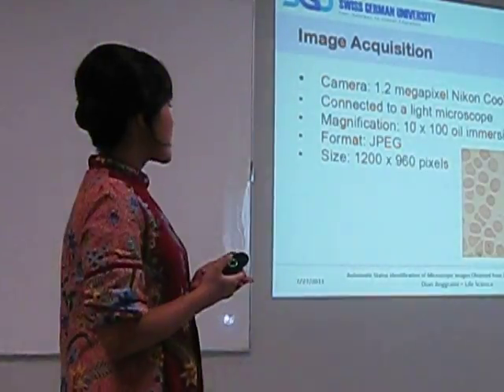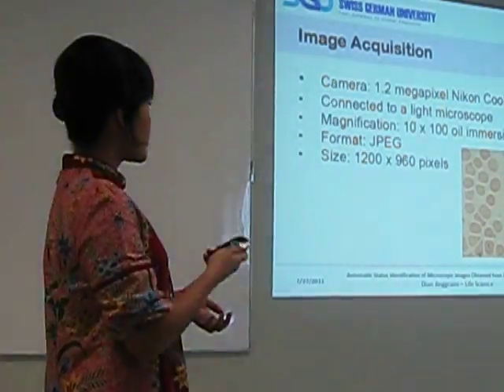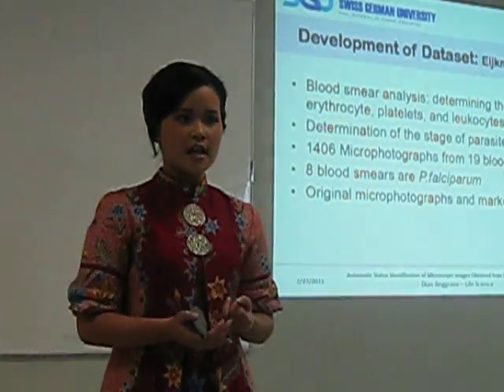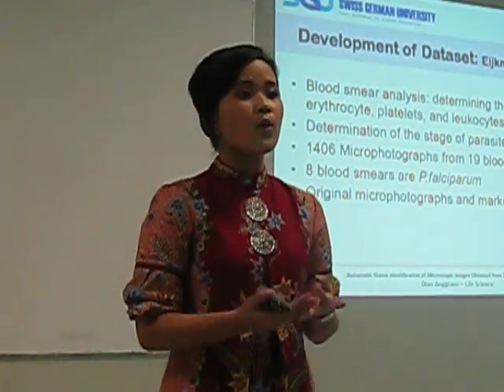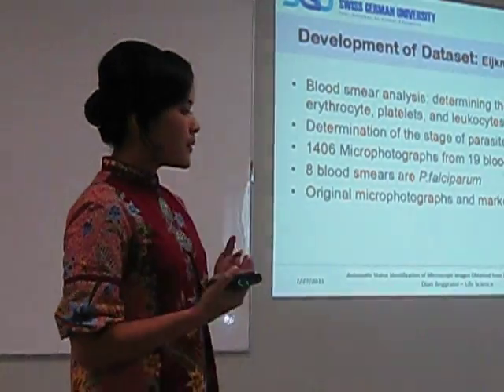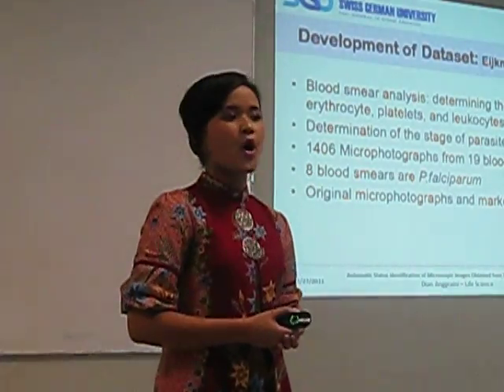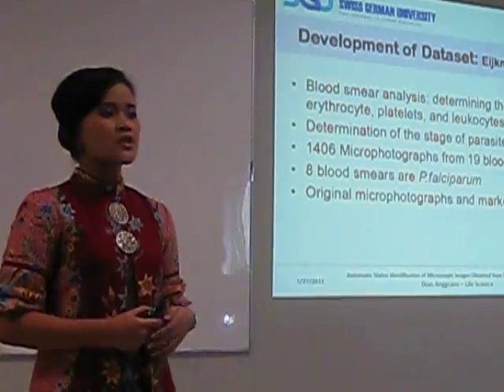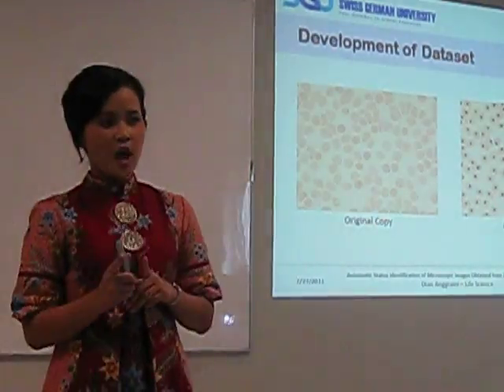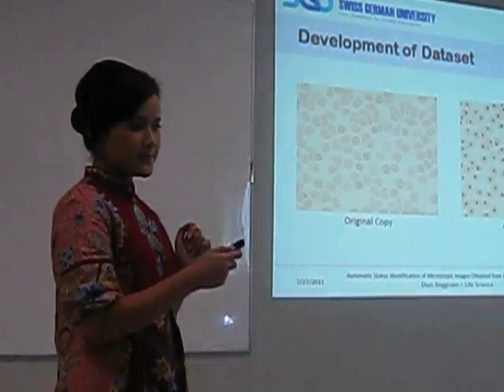All images were captured using a digital camera that is specifically built for the light microscope. One problem commonly found with previous studies is that the images are either unstandardized, taken from data banks, scanned, copied, or even use in vitro cultured parasites. Our work is superior in the way that we work side by side with experts from Eijkman Institute for Molecular Biology in the development of the data set. So they prepare the images and analyze the images. Therefore, for each image, we have the original copy along with the analyzed copy, so we can always refer back to the analyzed copy.